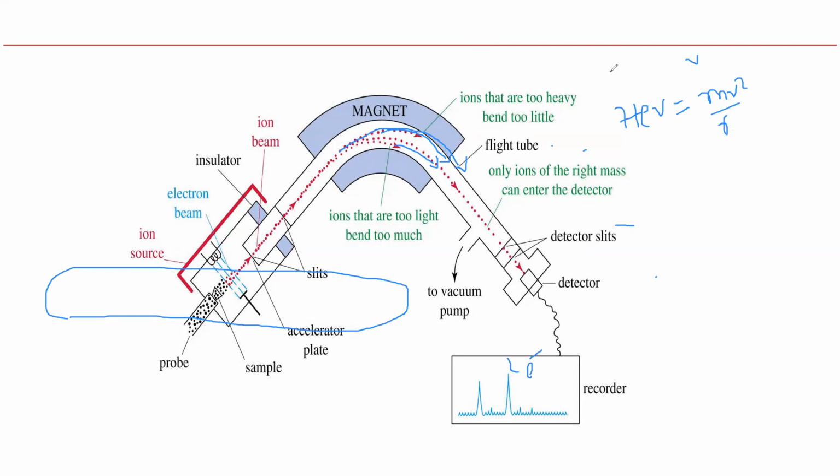The first is that the applied electric potential is directly proportional to the kinetic energy of the molecule, mv square. When you simplify these two, we will get one equation. We will discuss it in the next slide. They travel different curvature paths, and here they are separated by their distances. The molecules which follow a larger curvature path travel slowly. Those which follow a lesser curvature path reach the analyzer in a short period of time.